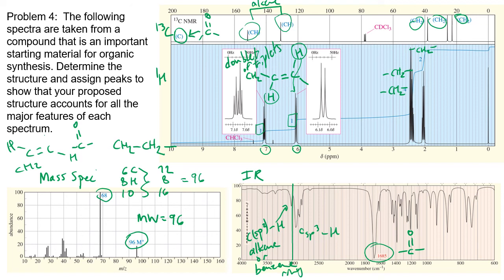Oh, okay, so we've actually accounted for all of the atoms somehow. Yet we have a CH2 that's by itself, another CH2 that's by itself. So the only way that this will work out is if those are connected. So what we must have here is actually a ring. So let's see if we can put that together.